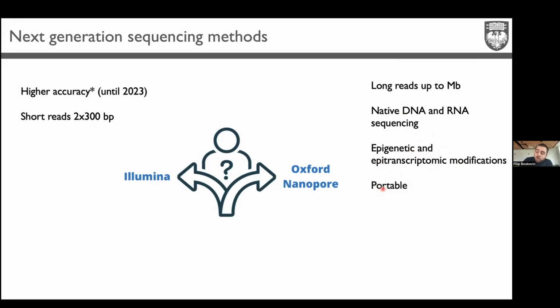The good thing that I mentioned before, it's portable. So I just brought it from the lab. I can plug it here and it should be completely fine. It enables real-time analysis. That's also very important. These two are very important for tracking epidemiology, and epidemiology in general, for tracking how infectious diseases are spreading and so on.